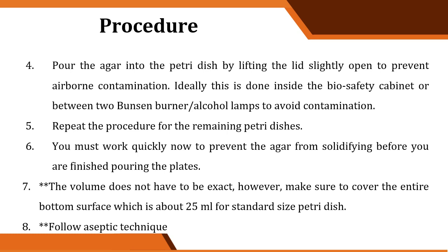Pour the agar into the Petri dish by lifting the lid slightly open to prevent airborne contamination. So ideally, this is done inside the biosafety cabinet or between two Bunsen burners or alcohol lamps to avoid contamination. So since wala tayong biosafety cabinet, sa desk lang tayo or tabletop magpe-perform. So repeat the procedure for the remaining Petri dishes. So you must work quickly now to prevent the agar from solidifying before you are finished pouring the plates. So note the volume does not have to be exact. However, make sure to cover the entire bottom surface, which is about 25 ml for standard size Petri dishes. And then follow aseptic technique.